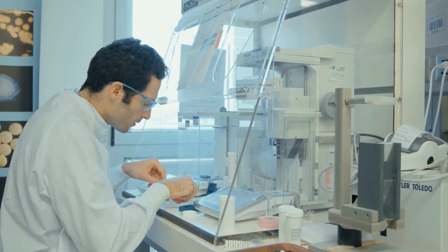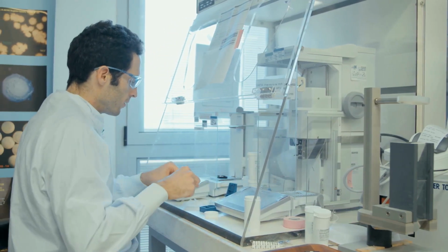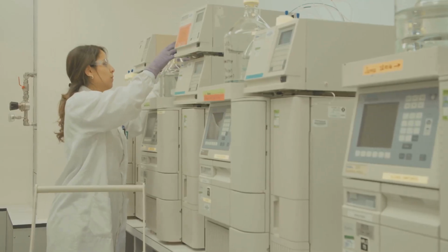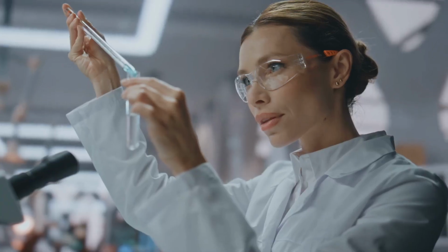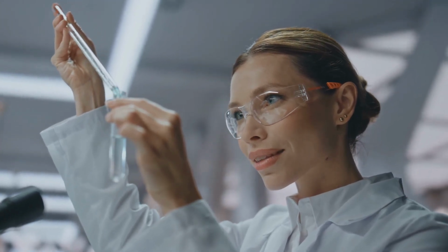Instrumental analysis provides precise and accurate measurements critical for quality control. Let's look at some common techniques. Gas chromatography, or GC. Its purpose is to separate and analyze volatile compounds. It's commonly used for purity testing and quantifying active ingredients.